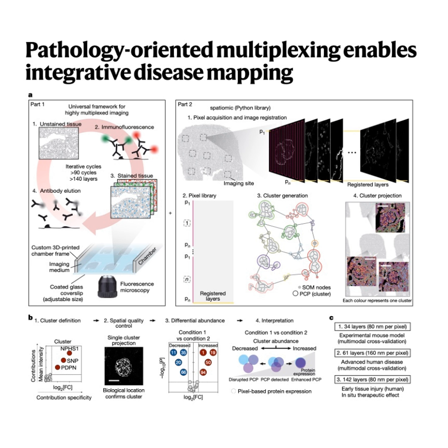Before we hit the software, is the hardware super specialized? Do you need a multi-million-dollar custom microscope? Actually, no. And that's a big plus. PathoPlex is designed to work with standard inverted fluorescence microscopes, either wide field or confocal, the kind many labs already have. That helps accessibility. Definitely.